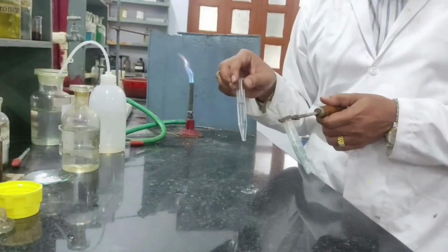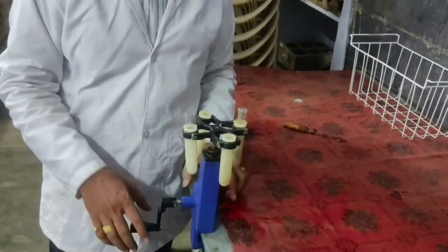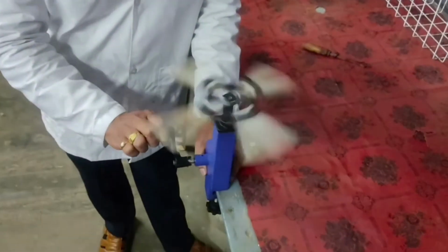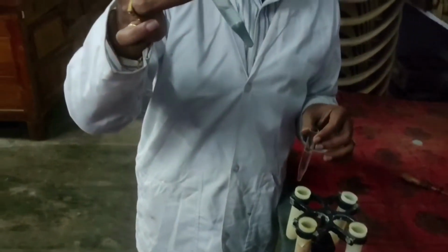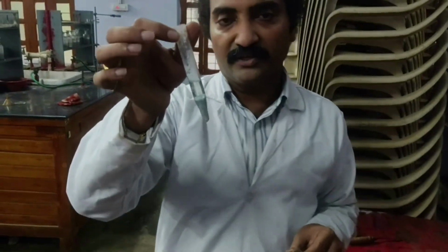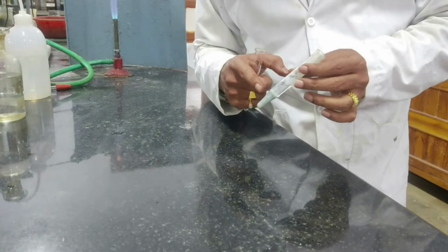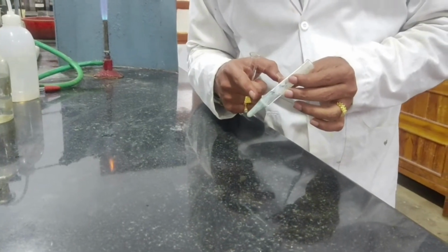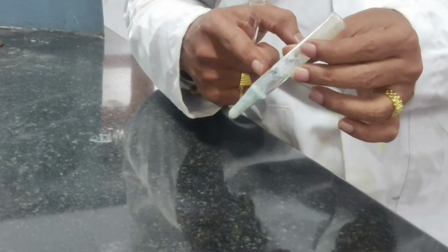Let's go for the centrifuge machine. I am setting into opposite holders of the hand centrifuge machine. I started centrifugation. Yeah, I got a beautiful residue here and also a centrifugate. Okay, centrifugation is complete. Let's go. So I got a precipitate. This precipitate is indicating the presence of Mn plus 2 and this centrifugate is to be tested for basically Zn plus 2.